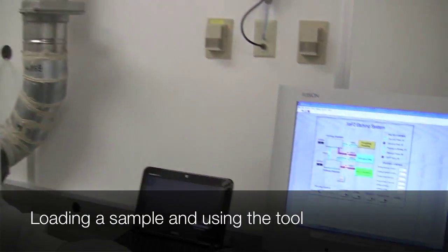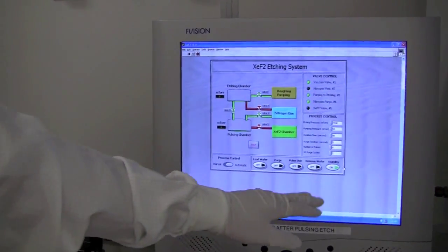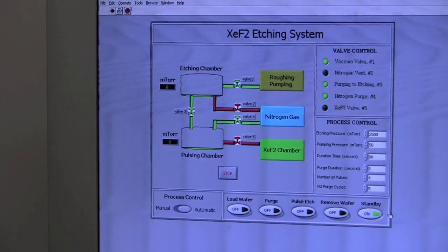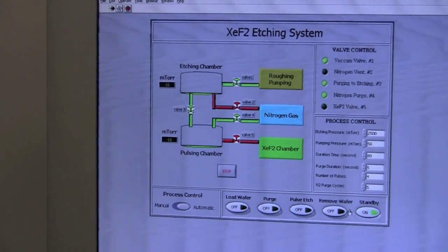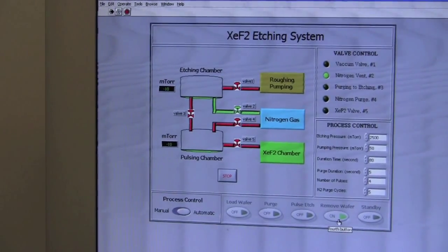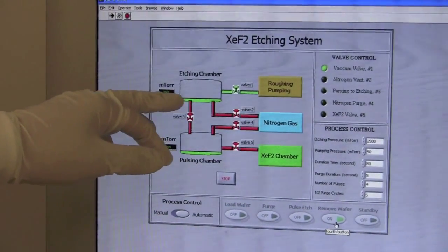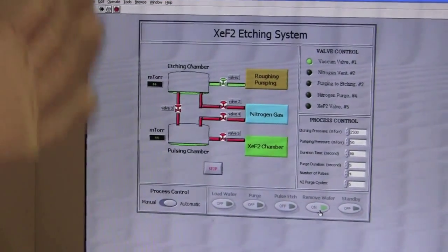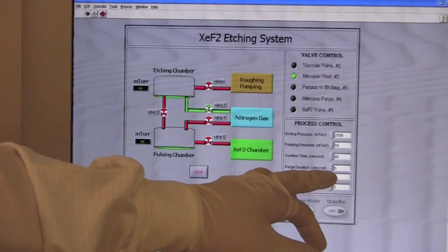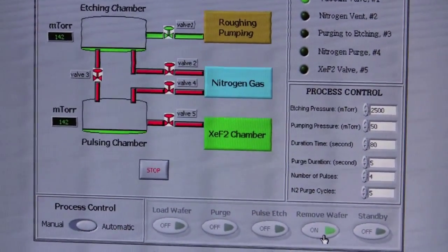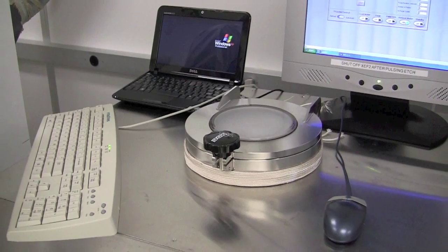Now that we've checked the chassis and made sure the chamber and everything in the machine looks good, we can start using our machine for our etching process. This is our control panel for the xenon difluoride machine. There's a couple of buttons, an overview of the chamber, and also a bunch of parameters that you can modify in your process control. So to begin, we want to hit the remove wafer button. While it's removing the wafer, it's actually doing a purge routine. A purge routine is just a routine where we have inert gas flood the etching chamber, which is the one located below, and then the roughing pump pulls out all the gas. Based on our parameters, it's going to run it five times for five seconds. So we have five cycles here and five seconds of purge duration. After it's done purging, this chamber will open up and allow you to load a sample.